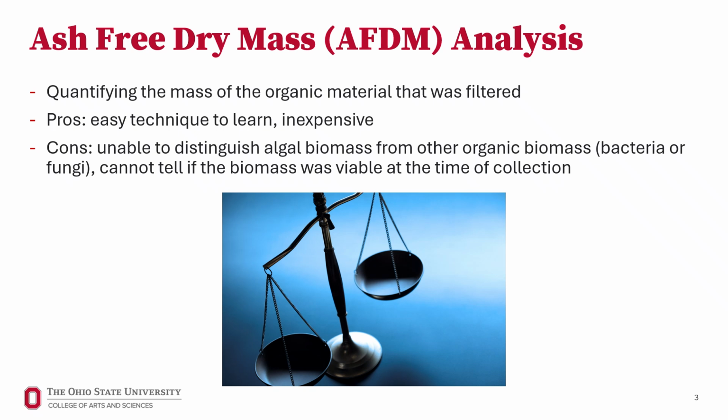When we analyze ash-free dry mass, we are going to be quantifying the mass of the organic material that we filtered onto the GFF filters during the last lab period. Ash-free dry mass is an inexpensive technique, and it is fairly easy to learn. However, some of the drawbacks of this technique include that it is unable to distinguish algal biomass from that of other organic materials, such as bacteria or fungi, and that you cannot tell if the biomass was viable or alive at the time of collection when using this technique.